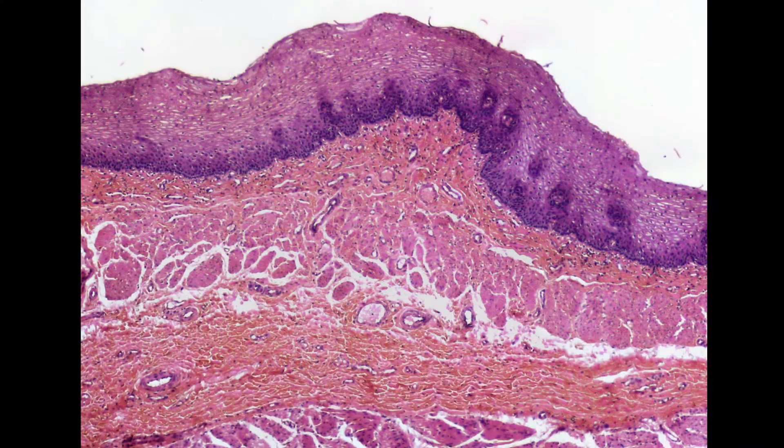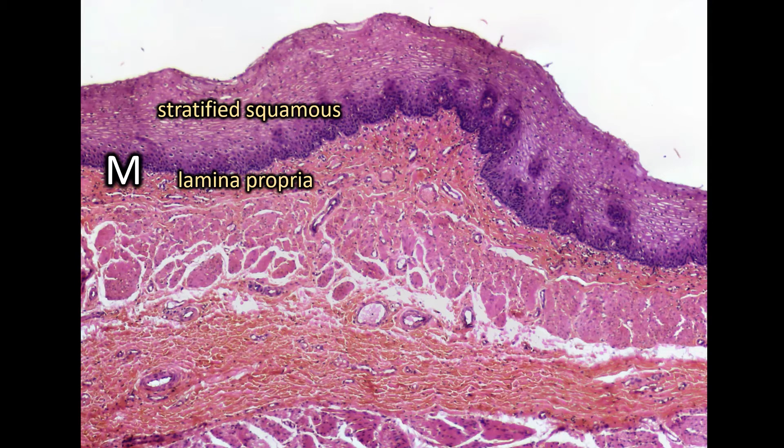Looking at the top layers a little more closely, from this view we can clearly see the little pancake cells stacked on top of each other in the mucosa — that's how we know it's stratified squamous. Underneath will always be the lamina propria and muscularis mucosa. Remember, the muscularis mucosa is always going to be smooth muscle. Unlike the muscularis externa, there's no transitioning in the types of muscle fibers that you're seeing in the muscularis mucosa.